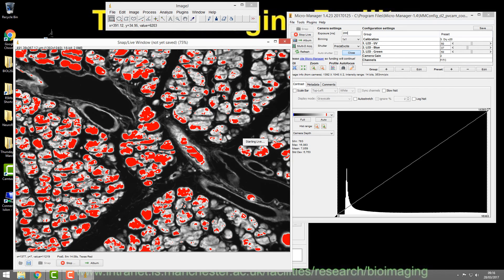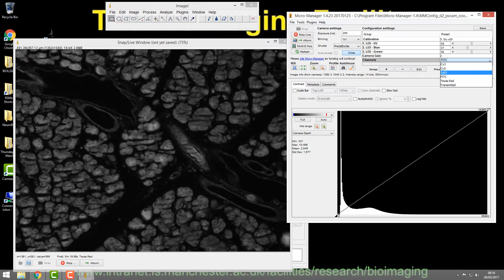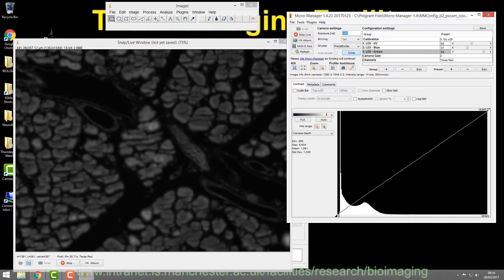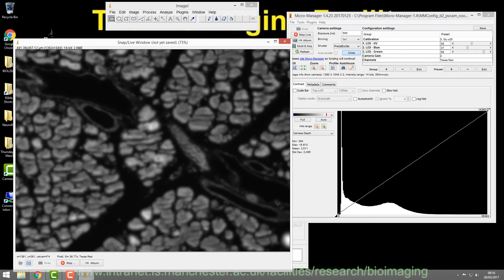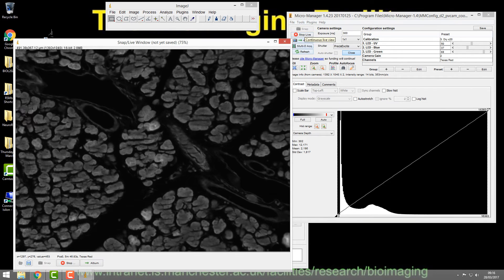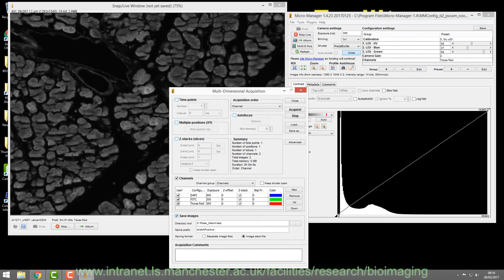Finally, drop down to the Texas Red channel. This uses the green LED. You might choose to move the exposure up to 500 milliseconds. Focus on your image — there's just a little bit of saturation there. Once you're happy with that, the exposure times for all three channels are defined.